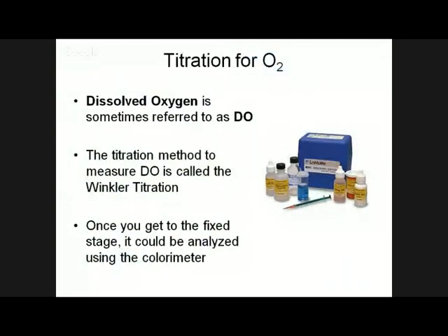Dissolved oxygen can be measured by using the DO meter or by the Winkler titration method, which is the standard procedure for the analysis of the DO, because DO is a very important parameter in the whole analysis. Once you have analyzed the DO and conductivity, these two parameters, you can know how much this water is contaminated. So these two parameters are very, very important before you analyze any other parameters.